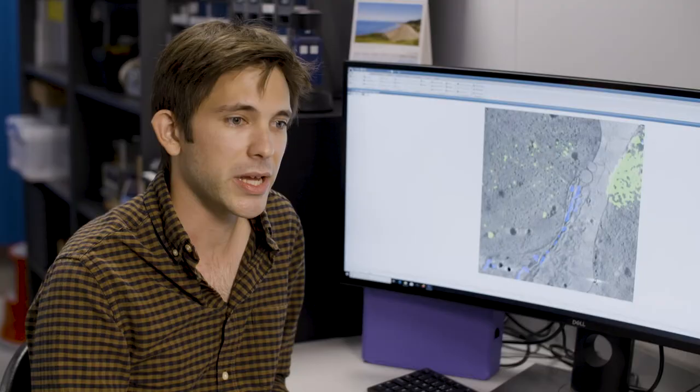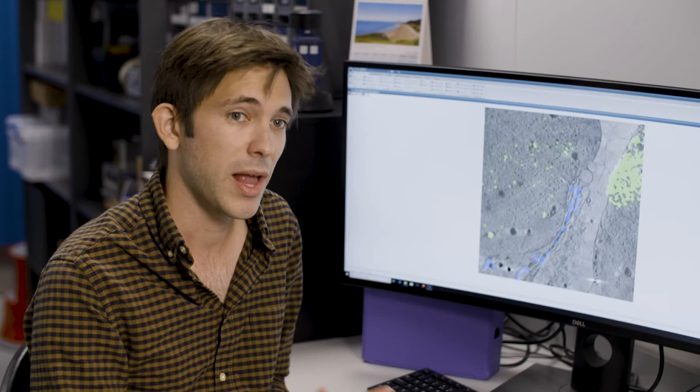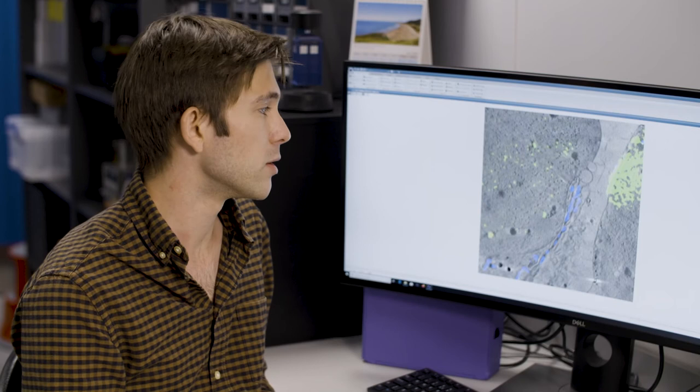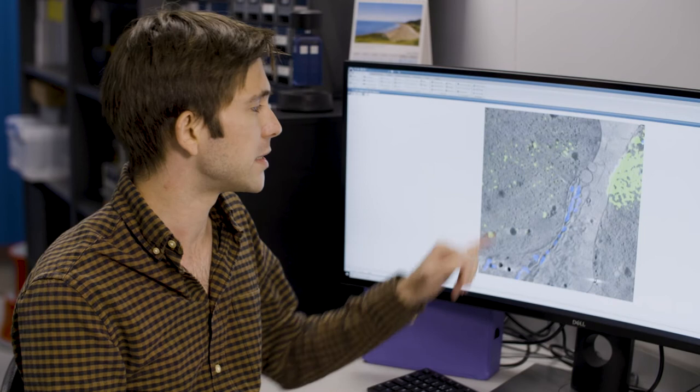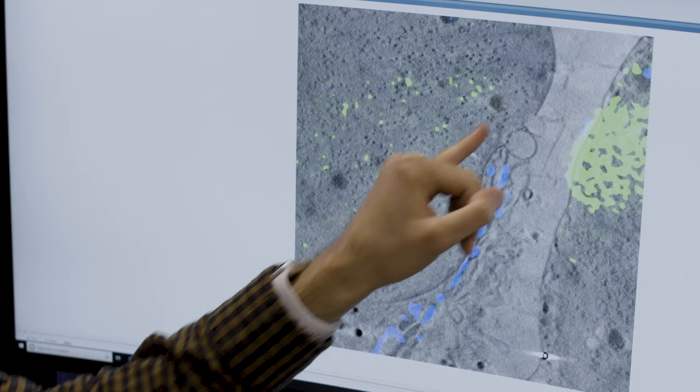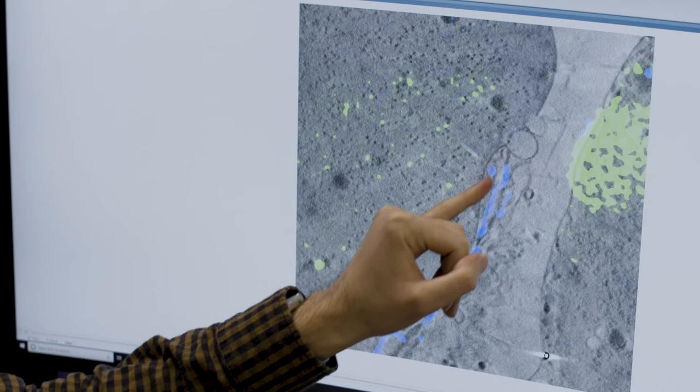So by merging the x-ray tomogram and the SIM of the same cell, we can study the distribution of specific viral components that we're interested in, in the wider context of the cellular environment. So for instance, here we can see viral components in the nucleus, appearing in green, associating with these black puncta. And in the cytoplasm, we can see mitochondria in blue, associating with the dark structures we see in the tomogram.